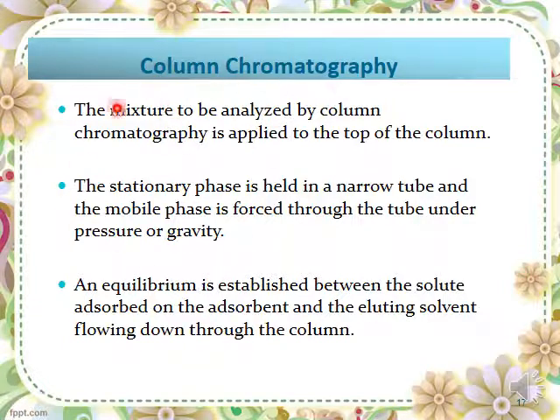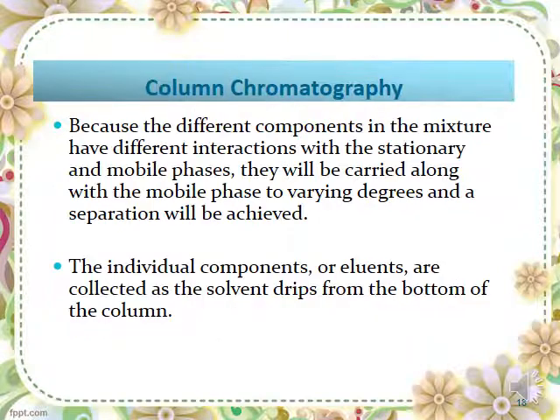Okay, so this is how it works. I have explained this. Just read through. And then you collect the sample at the bottom of the column.